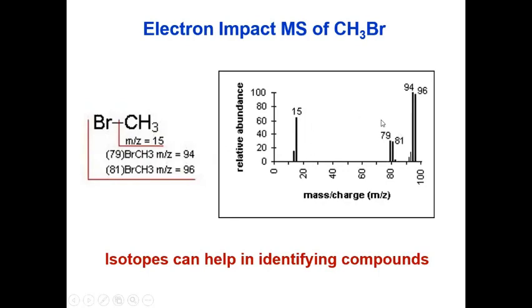So this is the mass spectrum of methyl bromide.